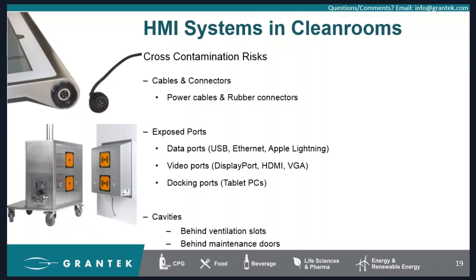So you want to make sure that you don't have to run any power cables, USB cables, Ethernet cables, these kind of things through different clean rooms without properly cleaning it to reduce the cross-contamination risk.